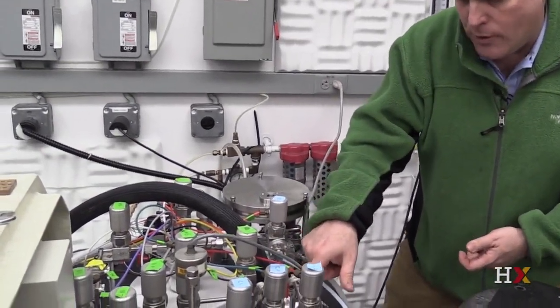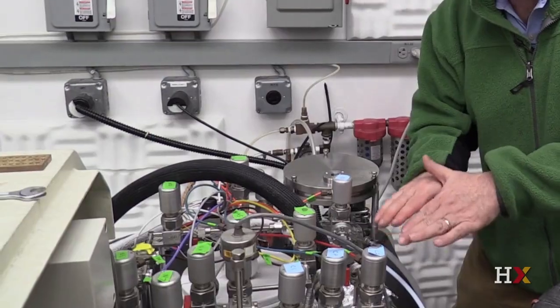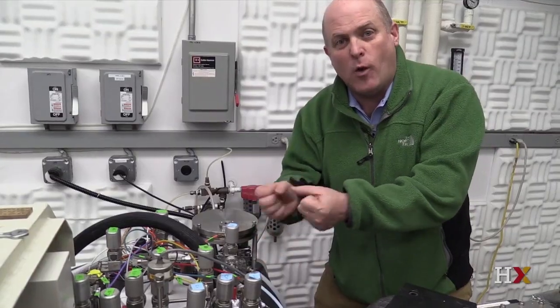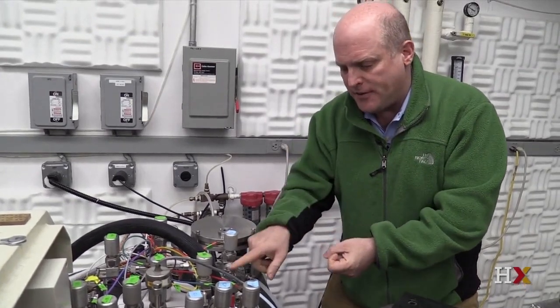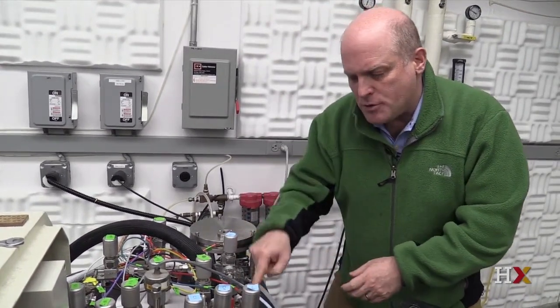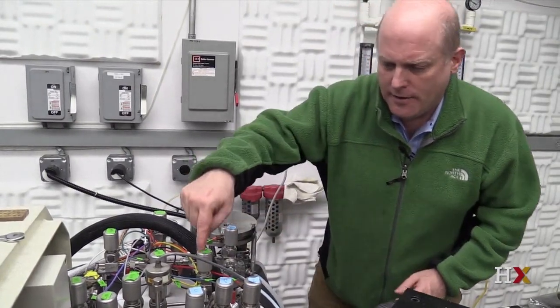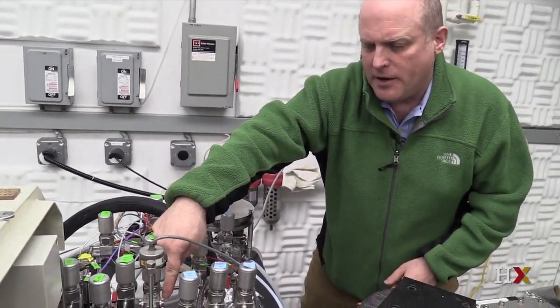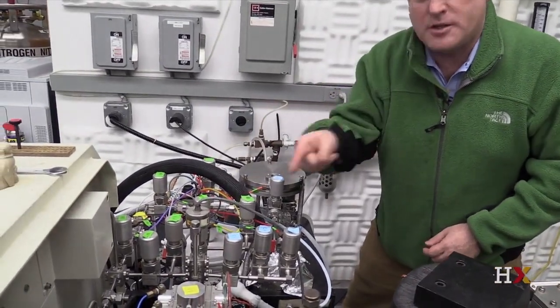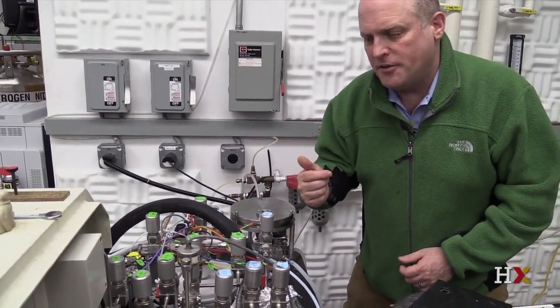This is a trap. There's a tube here that goes through a vat of alcohol that's sitting at about minus 80 degrees Celsius. Minus 80 degrees is cold enough to take all the water and freeze it to the walls of the stainless steel tube, but it's not cold enough to trap the CO2. So the CO2 gets through, but the water stays behind. And then ultimately, the carbon dioxide is frozen over here in a little finger, a little protrusion that's cooled down to liquid nitrogen temperatures, which is about minus 190 degrees Celsius.